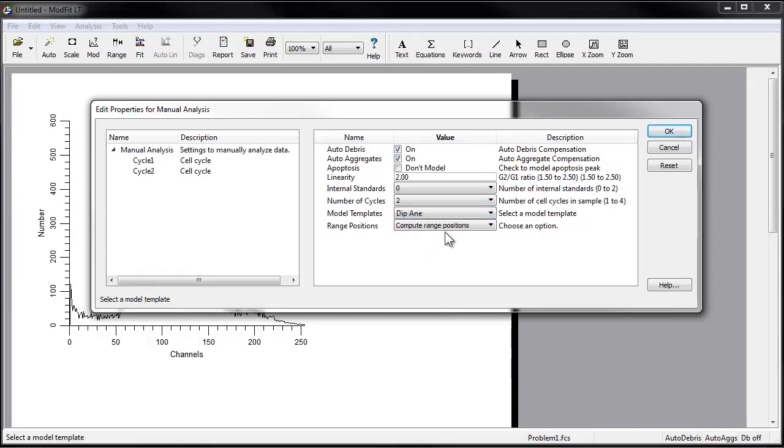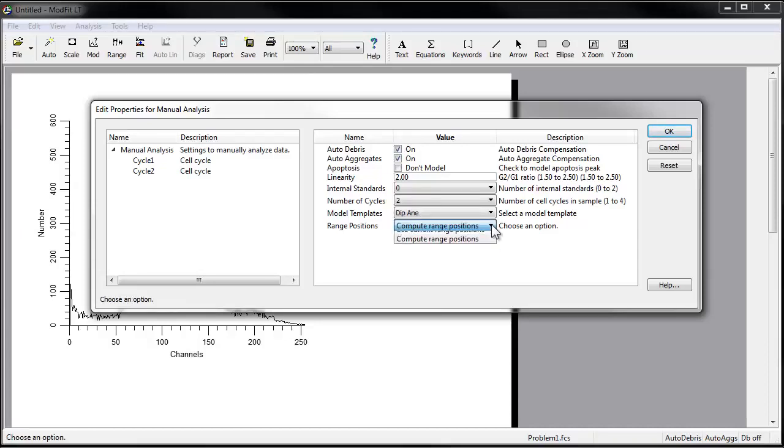Note that in the absence of an internal standard, this may be an arbitrary choice. For the range positions, choose Compute Range Positions. If you use this dialog to modify an existing model, you might choose Use Current Range Positions, so that the program does not move any existing ranges.